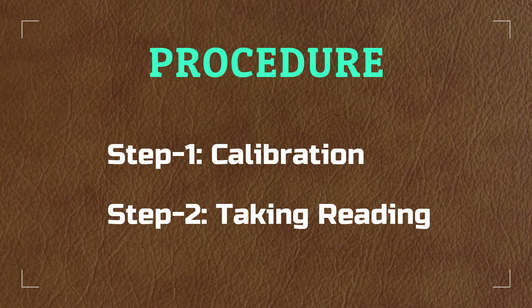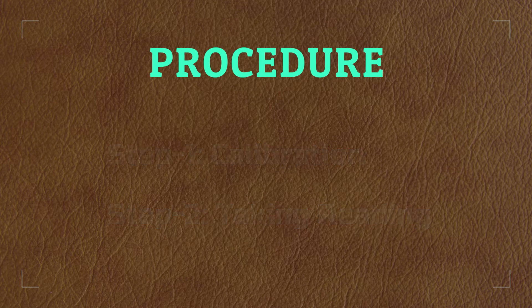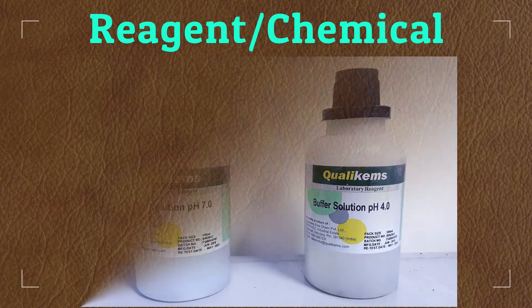The test involves only two steps: instrument calibration and taking reading. To conduct the test we need a pH meter, pH buffer 4 and pH buffer 7. So viewers, let's conduct the experiment for pH determination of industrial wastewater.